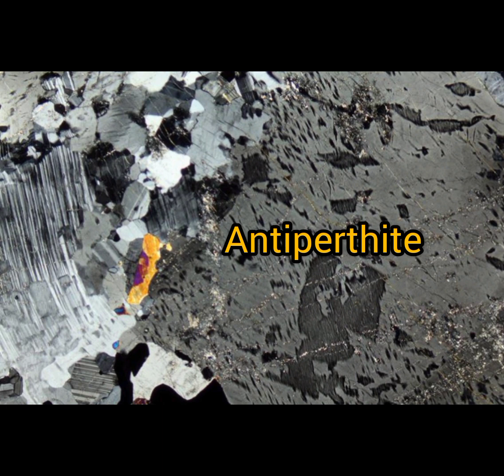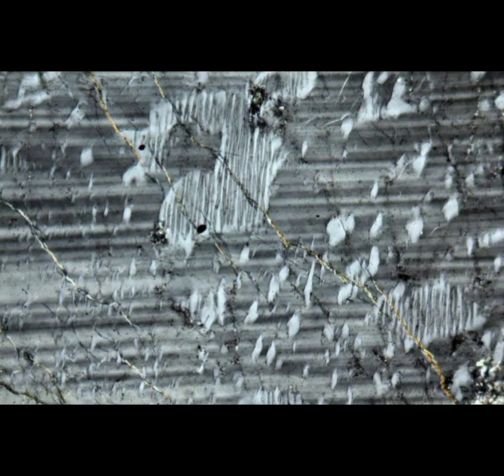Where both perthite and anti-perthite are present in equal portions, we call it mesoperthite.